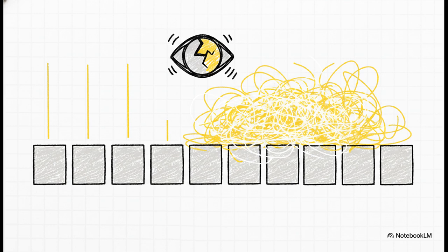If the machine washes A over the plate, and there are 2 A's in a row in the biological sequence, 2 A's get incorporated, right? So it emits twice as much light. 3 A's emit 3 times the light. All good so far. But when you hit 6 to 8 bases or more, the light signal no longer scales linearly. The optical detector simply cannot distinguish the brightness of 6 photons from 7 photons from 8 photons. It's just a blurry, bright flash. The result is a highly systematic insertion or deletion error rate, which we call indels. The machine literally just loses count.